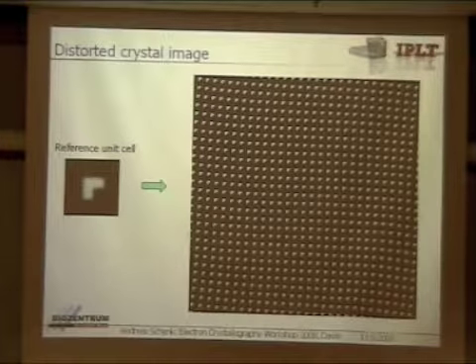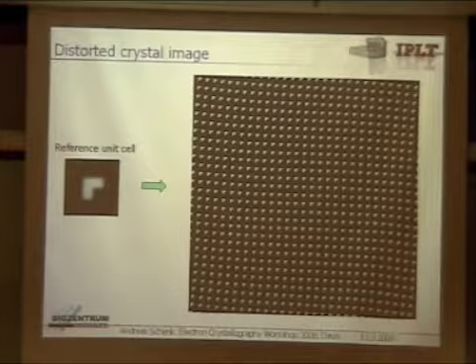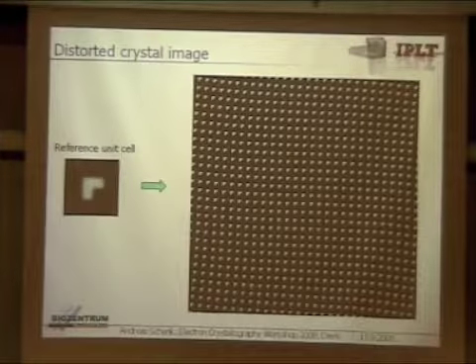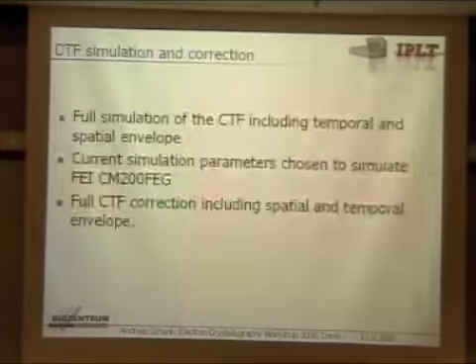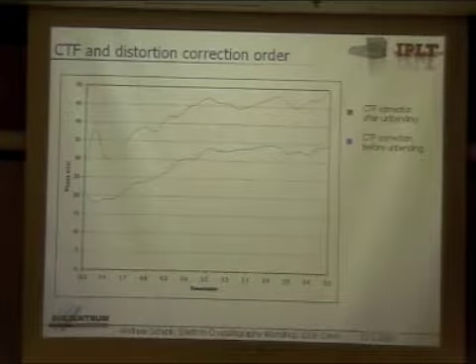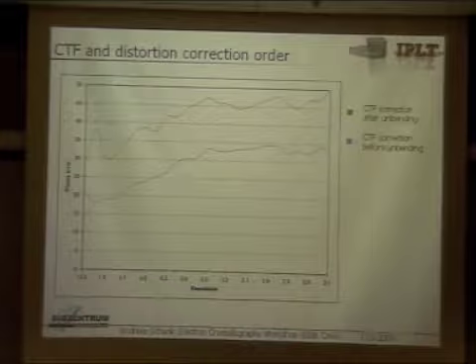Yeah, so it's hard to relate that to the scale of this. What did you assume the unit cell size is here? Unit cell size is 100 angstrom. 100 angstrom, the distortion is 1 angstrom. Yeah. So what I have to say is here, the absolute scale of the error really depends much on the amount of distortion you have. That's the most crucial factor.